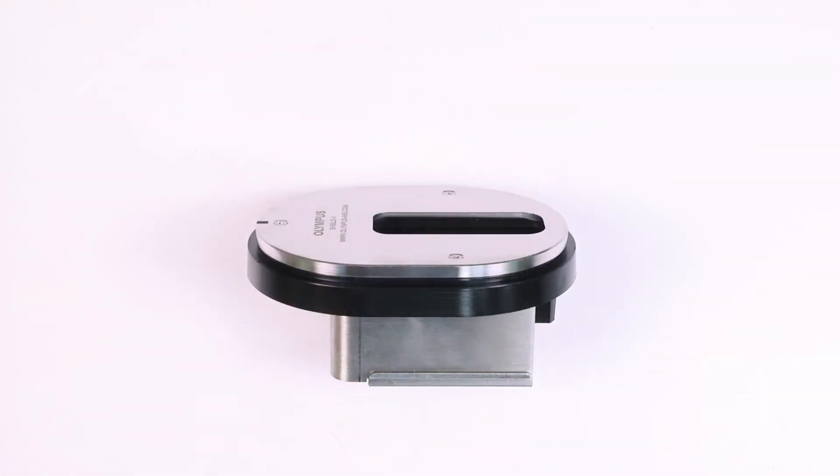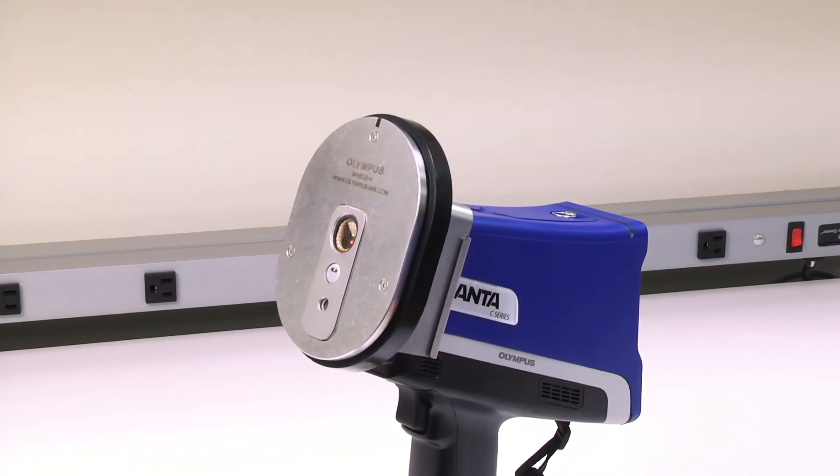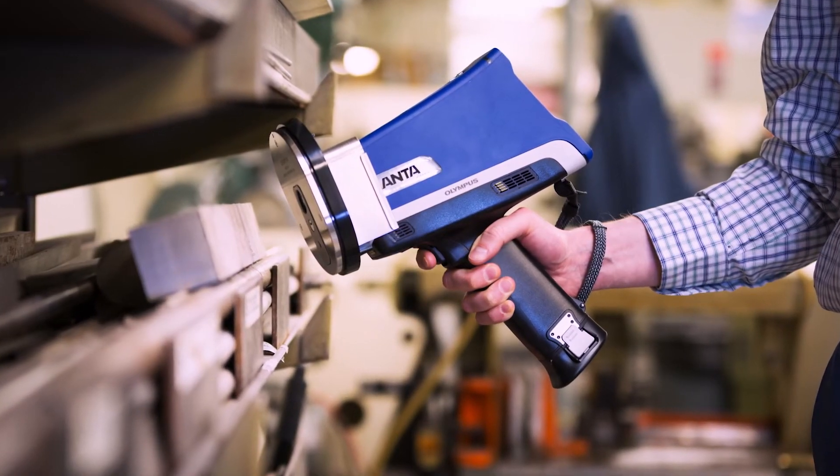The deck of the field stand is also sold separately as a probe shield. This can be used when testing samples to shield the user from secondary scattered x-rays.